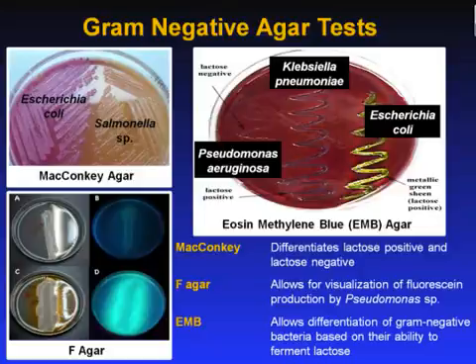The bottom left photo shows F-agar, sometimes called flow agar. It is used to stimulate production of the pigment fluorescein. This allows for specific detection of Pseudomonas species. Note the intense fluorescence of the pigment fluorescein under UV light. A shows Pseudomonas fluorescens growing on nutrient agar in ambient light. B shows Pseudomonas fluorescens growing on nutrient agar in ultraviolet light. C shows Pseudomonas fluorescens growing on F-agar in ambient light, while D shows Pseudomonas fluorescens growing on F-agar in ultraviolet light.